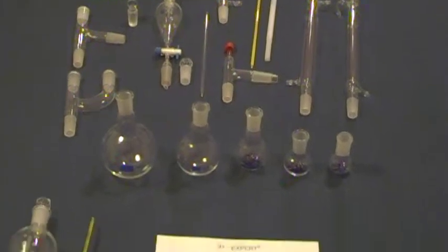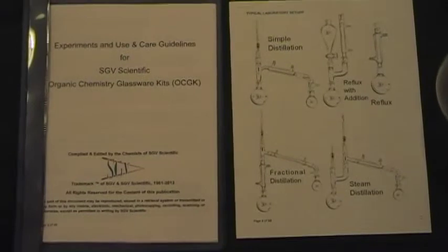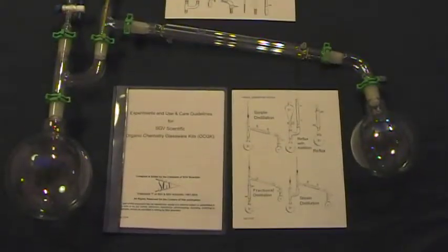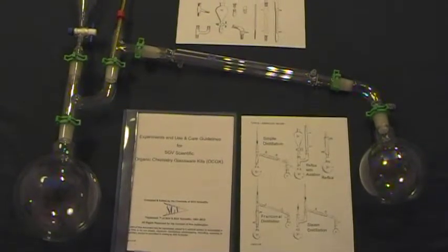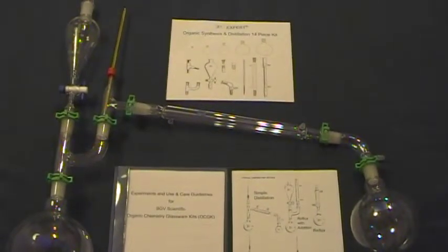This kit also comes with a booklet of experiments and use and care guidelines for your organic chemistry glassware kit. It has numerous experimental procedures, practical safe handling techniques, and details for proper installation, assembly, and use of your glassware kit. As we are all chemists at SGV, we have compiled and edited this booklet with great care and accuracy to assure that all of your organic chemistry needs are met.